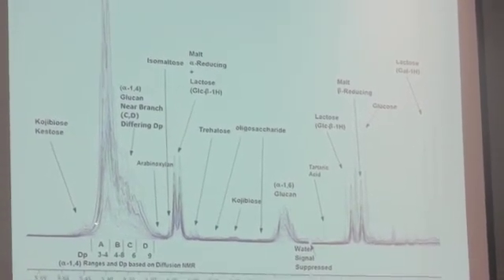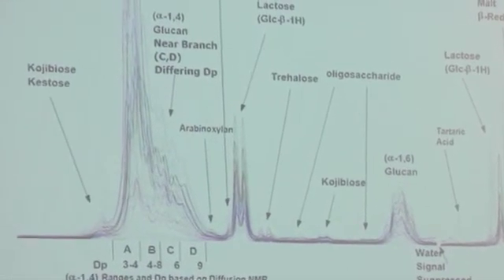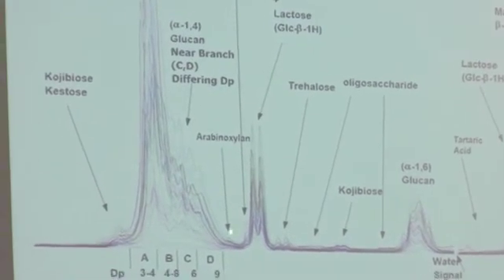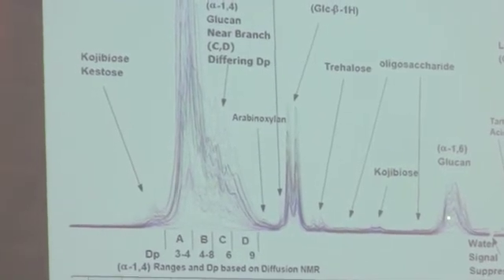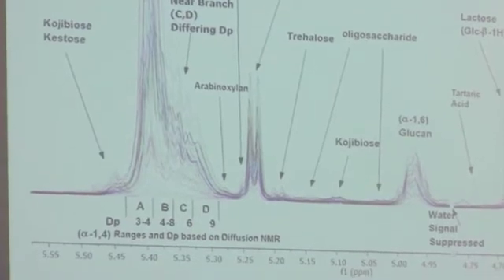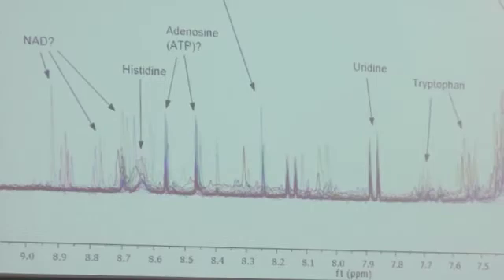But when you look at this, you'll see this is actually maltose, where you would end up with yeasty munchable sugars. And then all this stuff down here is glucoses that are near a branching point, and these guys are actually the branching point. So when you look at things like Brettanomyces beers, they always have very different distributions of all this stuff. And then I'll keep going.